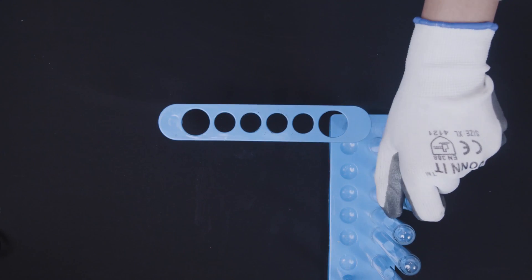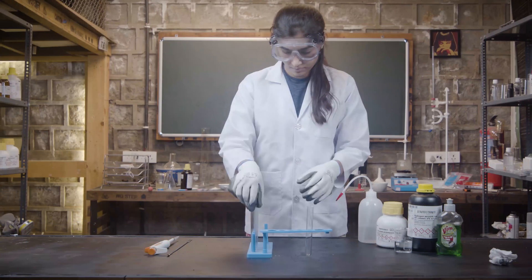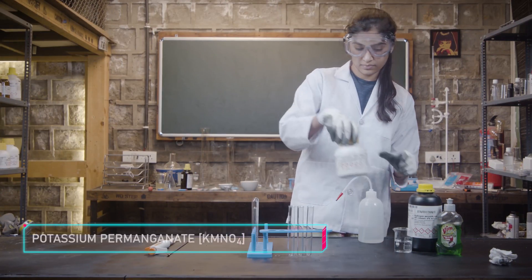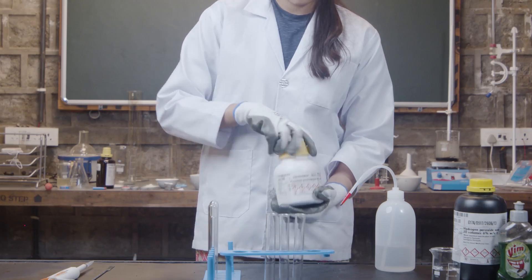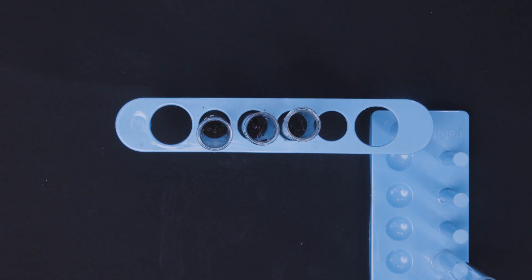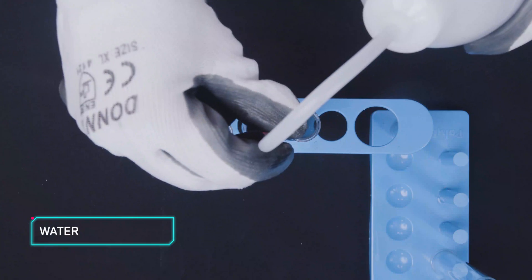This time, take three test tubes and to be on the safer side, put them in a stand. Now, put a little potassium permanganate in the three test tubes. Next, skip the first tube and pour a little water into the other two tubes.